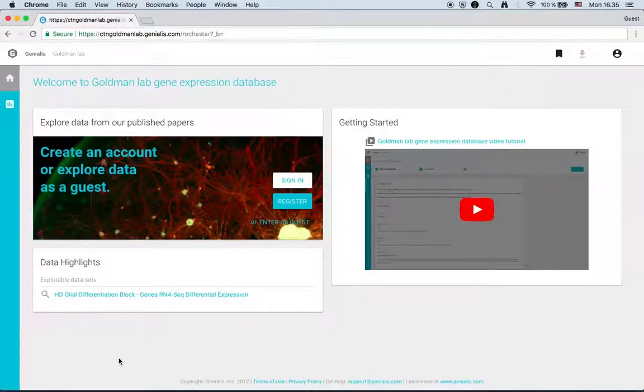Welcome to the Goldman Lab Gene Expression Database. This is a quick video tutorial on how to interact with the platform.